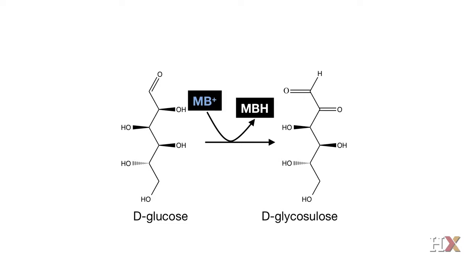Reduced methylene blue is colorless. But as fast as reduced methylene blue is produced, it will be reoxidized into methylene blue by the oxygen that is dissolved into the solution. So the solution will be blue. But as time goes by, the oxygen dissolved in the solution gets consumed.